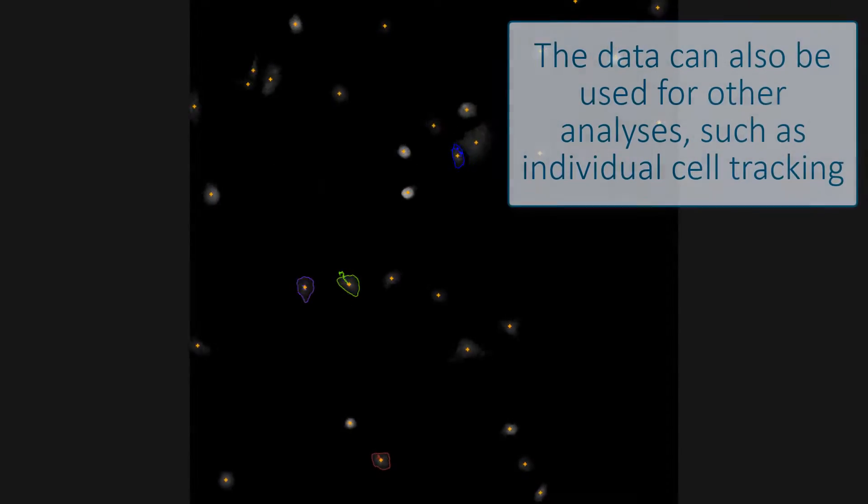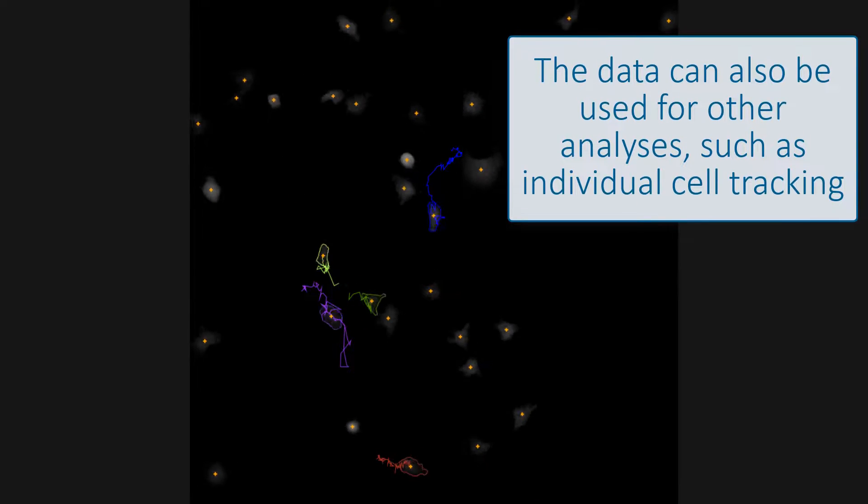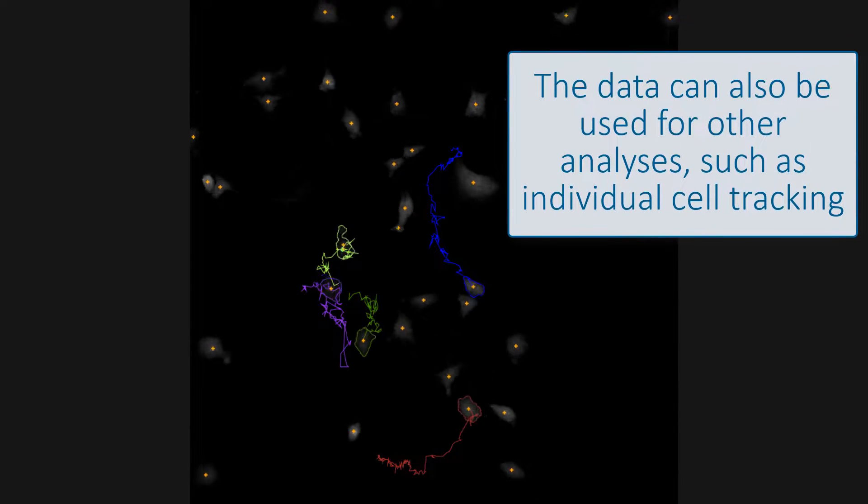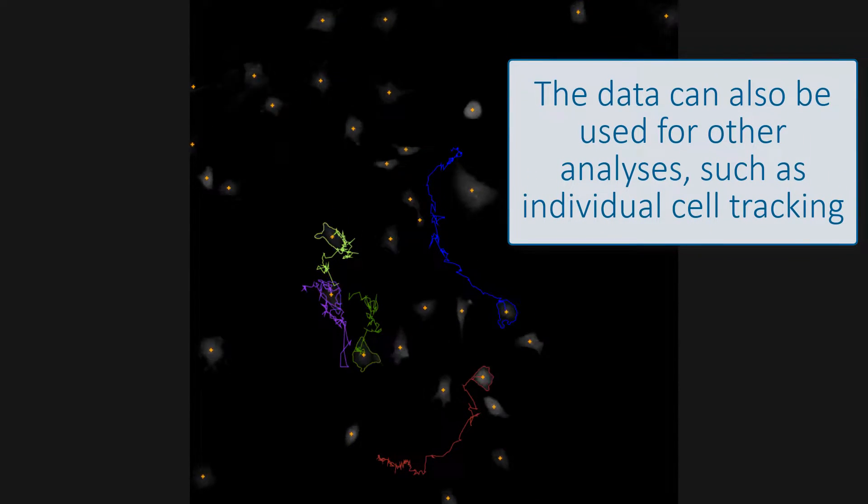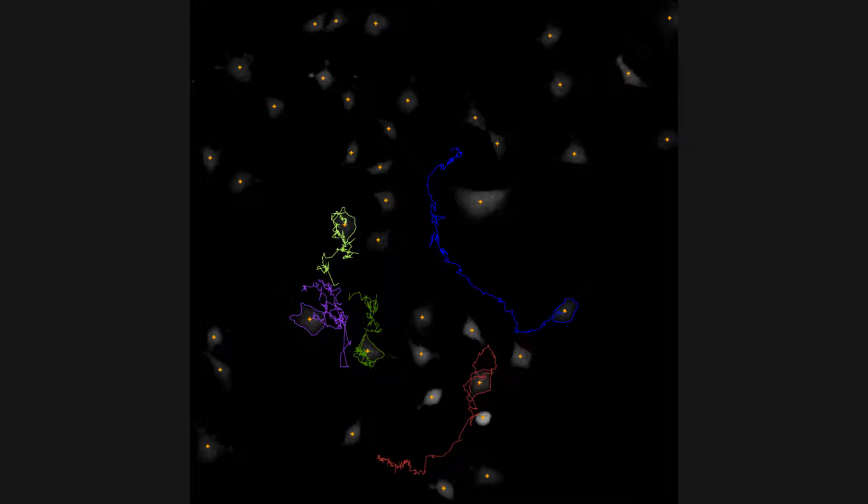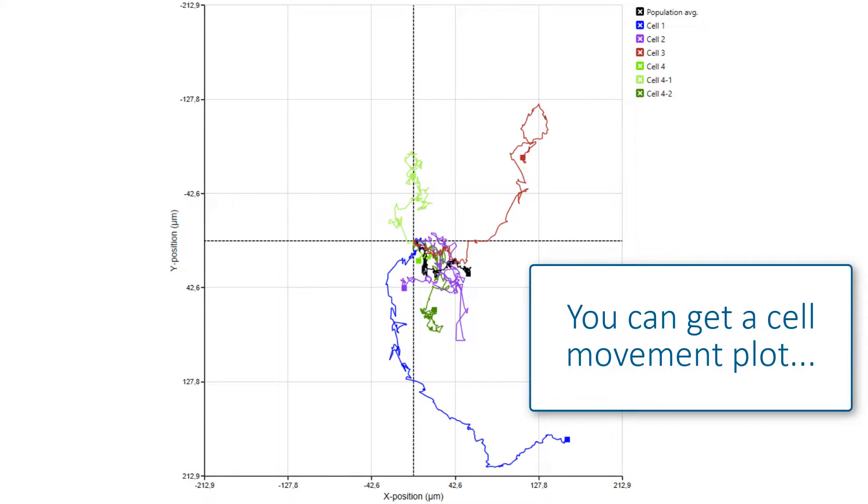The images and data from one experiment can be used for other analysis as well. For example, you can track individual cells. The software generates the cell movement plot.